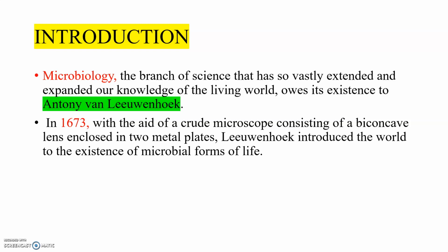In 1673, with the aid of a crude microscope which he invented, consisting of a biconcave lens enclosed in two metal plates, Leeuwenhoek introduced the world to the existence of microbial forms of life. So we can discuss some of the historical aspects dealing with the invention of microscopy.